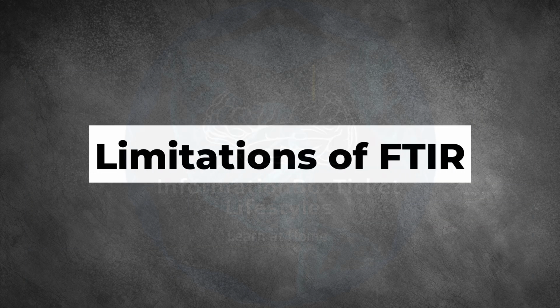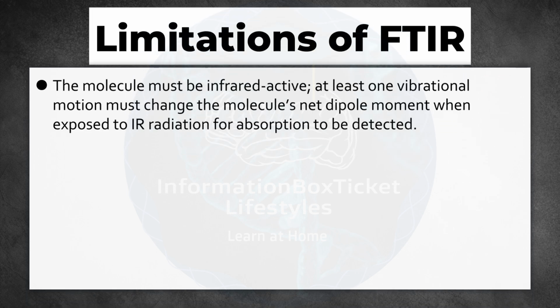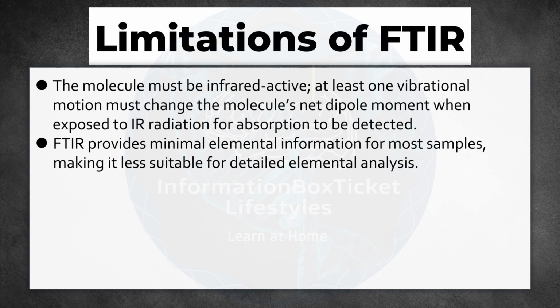Limitations of FTIR. The molecule must be infrared active. At least one vibrational motion must change the molecule's net dipole moment when exposed to IR radiation for absorption to be detected. FTIR provides minimal elemental information for most samples, making it less suitable for detailed elemental analysis.